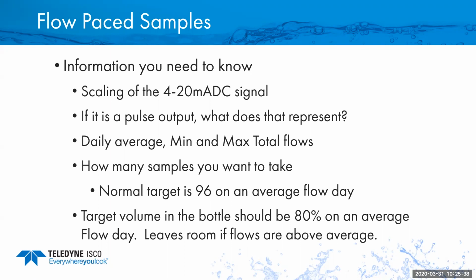In order to figure out your sampling routine, as in how many samples I want to take, how much sample do I want to take every time, we need to know your daily averages for your flow. We need to know the minimum flow rates that you ever get, and we also want to know the maximum flow rates that you ever get. This can help you determine how many samples you want to take as well.